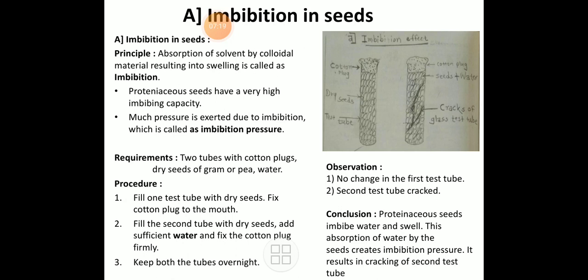The conclusion is that proteinaceous seeds imbibe water and swell. This absorption of water by the seeds creates imbibition pressure, and it results in cracking of the second test tube, isn't it?